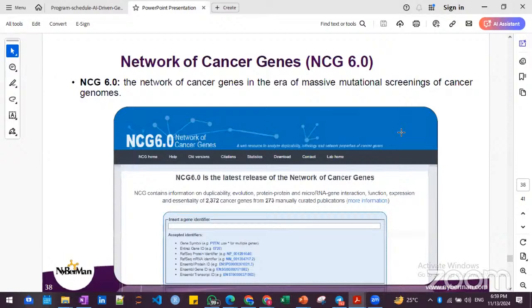Then there is NCG, and also we have the reference sequence.